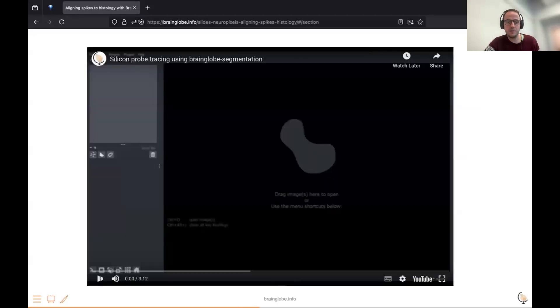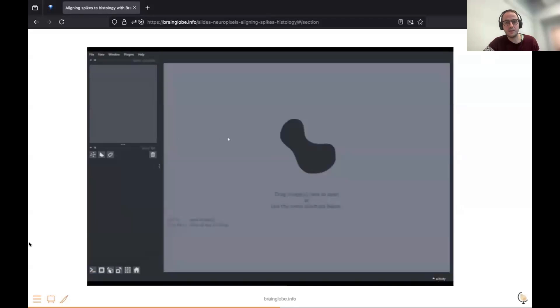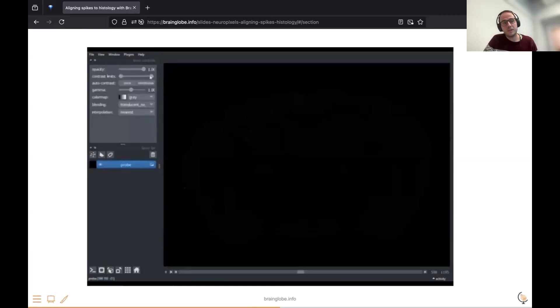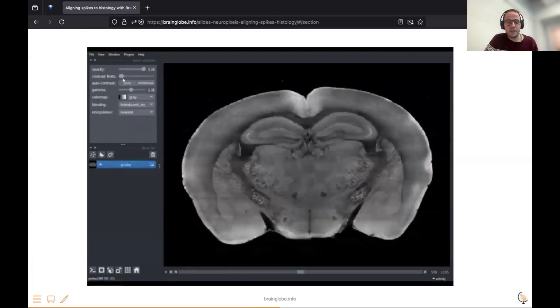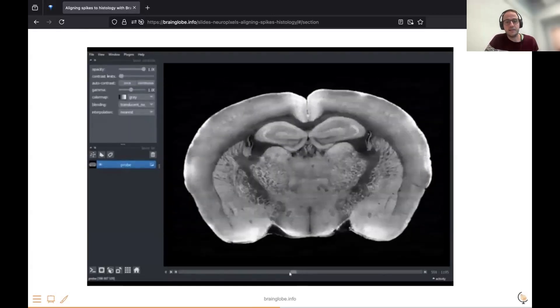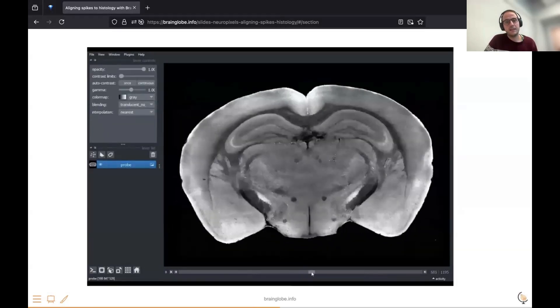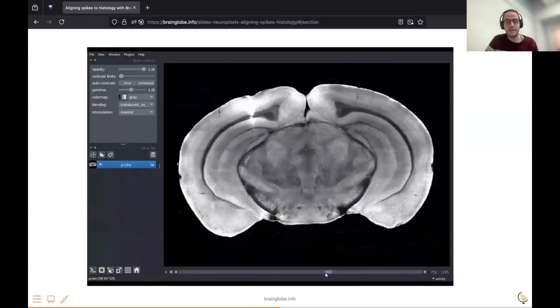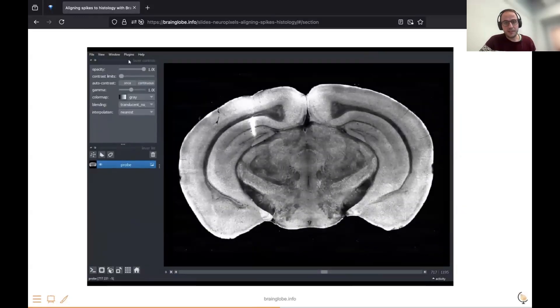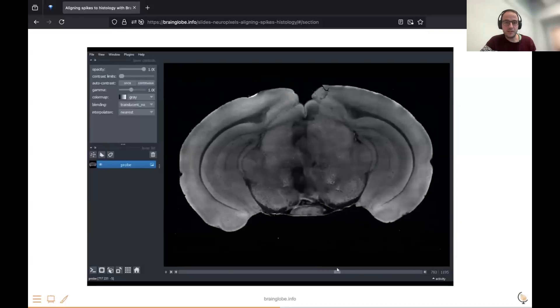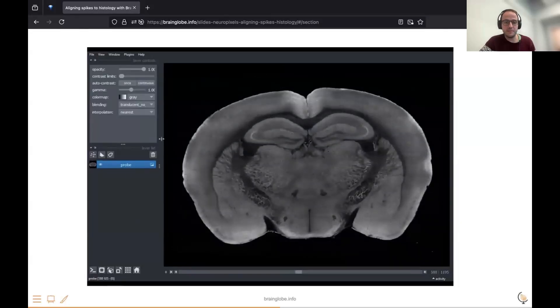I will show you a quick demo — in the interest of time, this is a video. All our tools are available through Napari. If you don't know Napari, it's similar to ImageJ but is a Python-based image viewer that allows you to drag and drop your data into it and works with lots of file formats. Here you should be able to see the bright probe in the cortex.